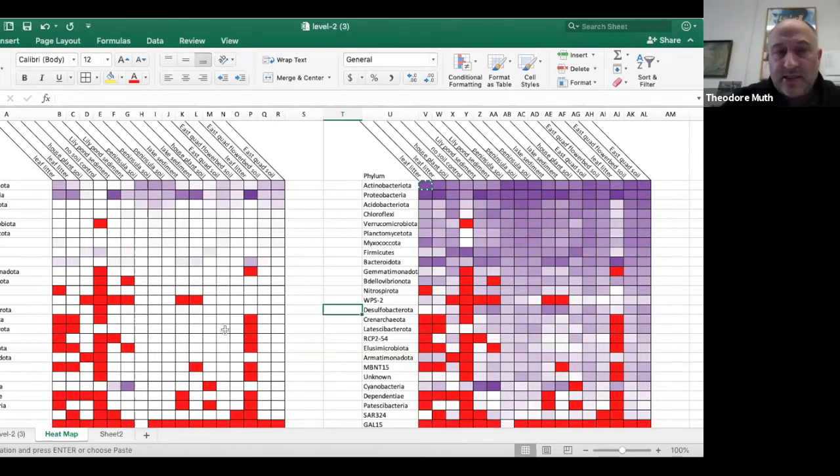So, yeah, I believe that these data going into the QIIME2 bar plot are rarefied, so there should be some normalization there already. But you can either do that within the Excel sheet if you want, or you can just check your parameters when you're downloading the CSV file from the QIIME2 view. But again, I've just taken the file from QIIME2 view because it just followed naturally, but you can get the CSV file directly from the DADA2 output or the QIIME2 output.